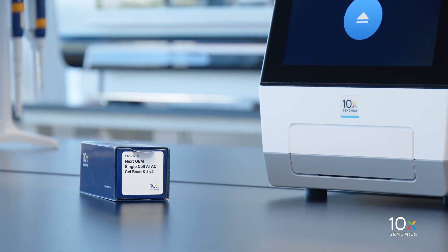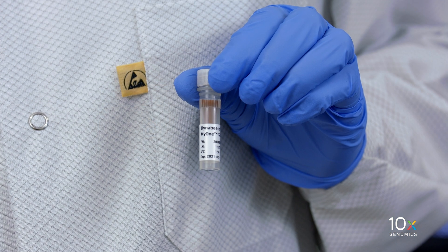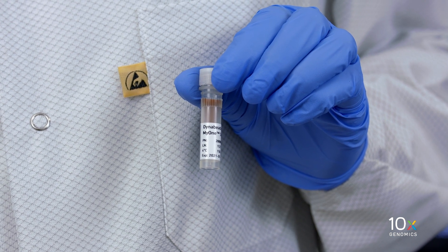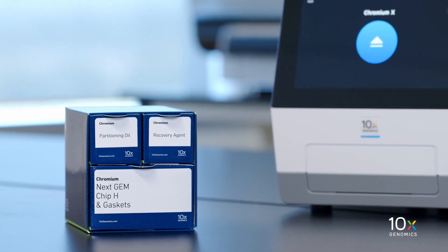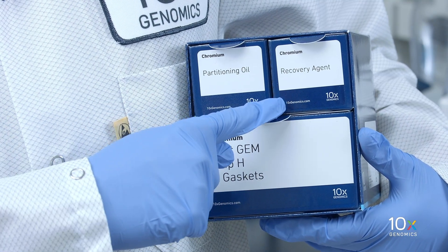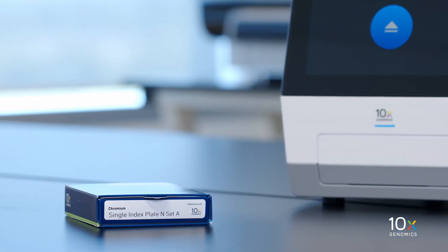The Chromium Next GEM Single Cell ATAC Gel Bead Kit v2 is stored at minus 80 degrees Celsius. The Dynabeads MyOne Silane are stored at 4 degrees Celsius. The Chromium Next GEM Chip H Single Cell Kit is stored at ambient temperature and contains Partitioning Oil, Recovery Agent, Chromium Next GEM Chip H, and Gaskets.